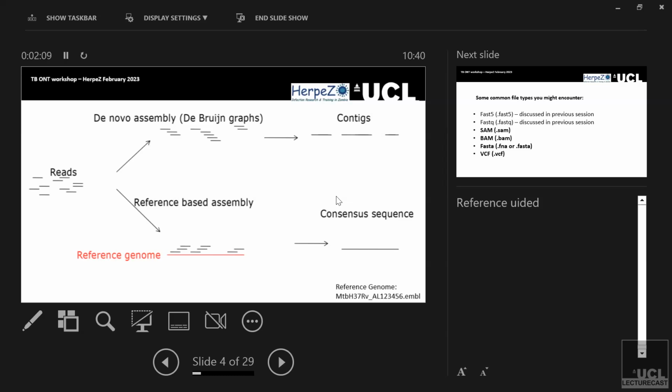It will bring up what are called contigs. Contigs are the program's best attempt at putting these bits together. You might find that maybe it can't quite work out certain areas. You might get one whole contig, which would be a whole genome. You might get 2 or 3. It's just its best attempt to put all the pieces into the right place.